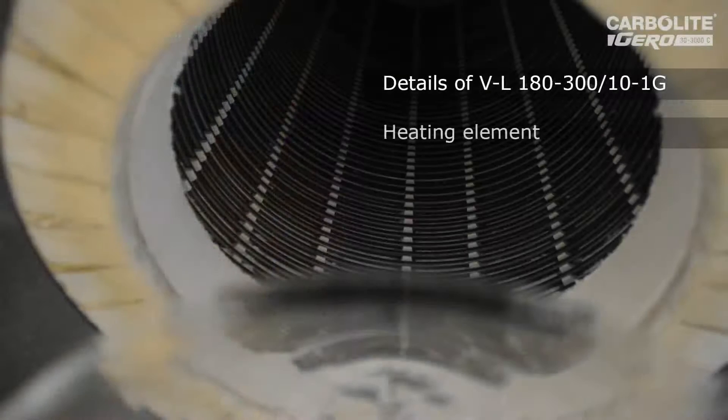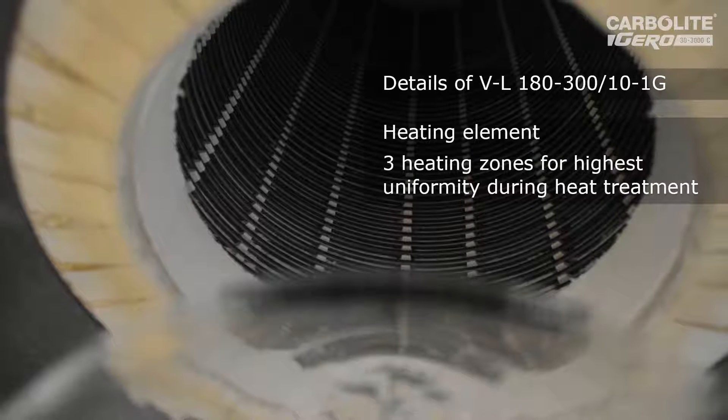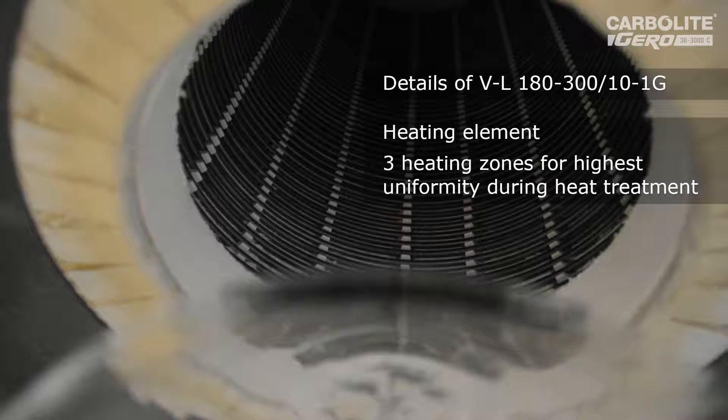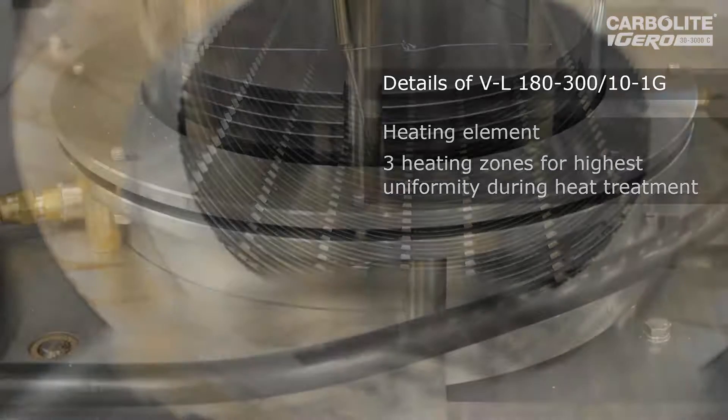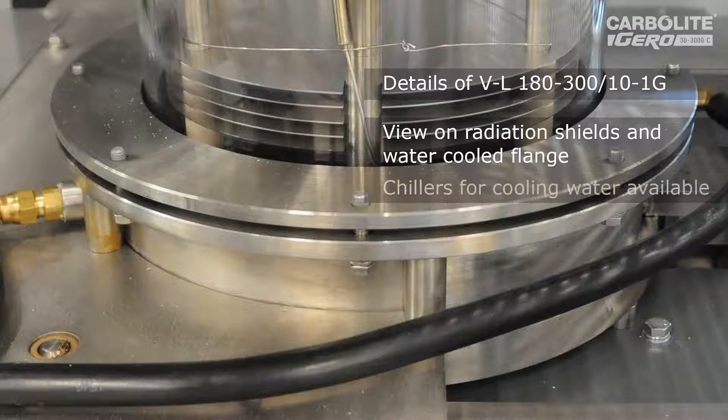You see the heating element — we have a very stable heating element for longest lifetime and the highest heat-up ramps. The only water-cooled device is the lower flange, for which we can also supply a chiller for the customer.